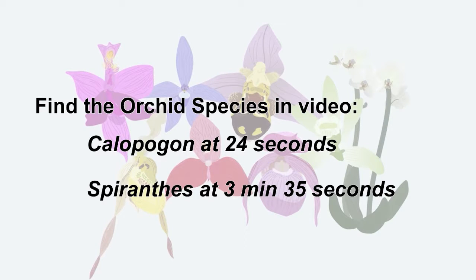In this video, we'll show you how to do measurements for a couple different orchid species. Make sure to fast forward for the species that you're looking for.